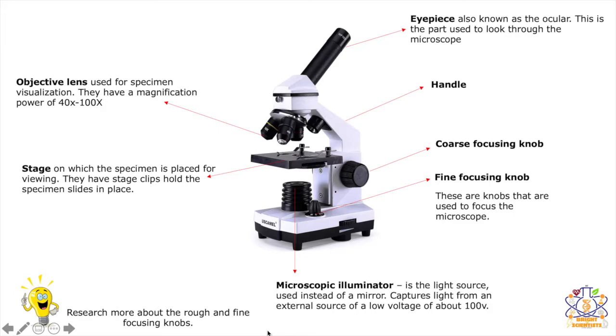Pause the video now and try to research more about the coarse and fine focusing knobs.